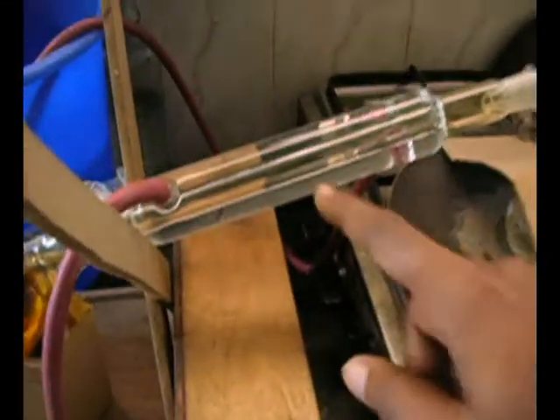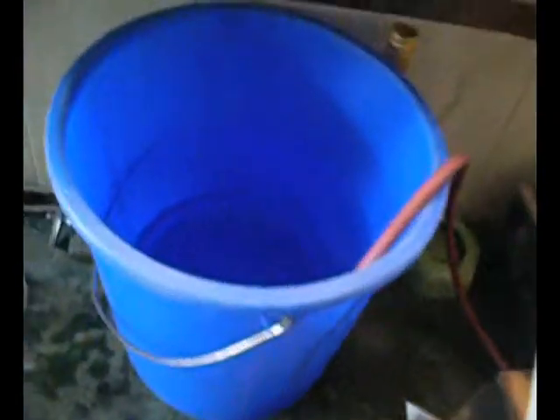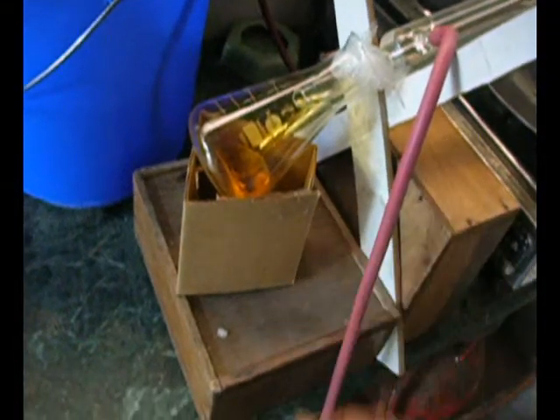You can see the nitric acid dripping. This is the condenser — water runs from this bucket through this tube into the condenser, then comes out through this tube and gets back into the bucket. And there you have concentrated nitric acid.